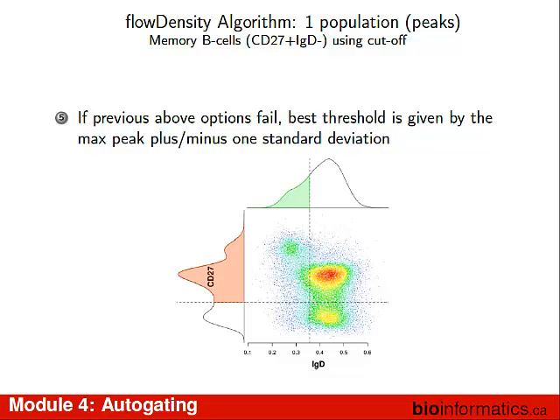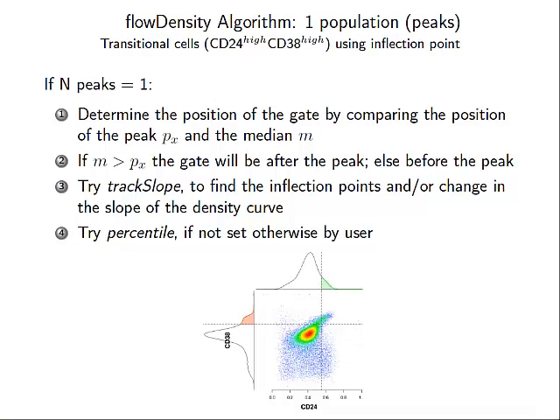So the third flow density algorithm output is using the cutoff value. Let's look at the figure next to that, where it looks like there are two blocks. Are you using an inflection point there? I don't know off the top of my head, but I'm almost positive this one's an inflection point that we're trying to find.